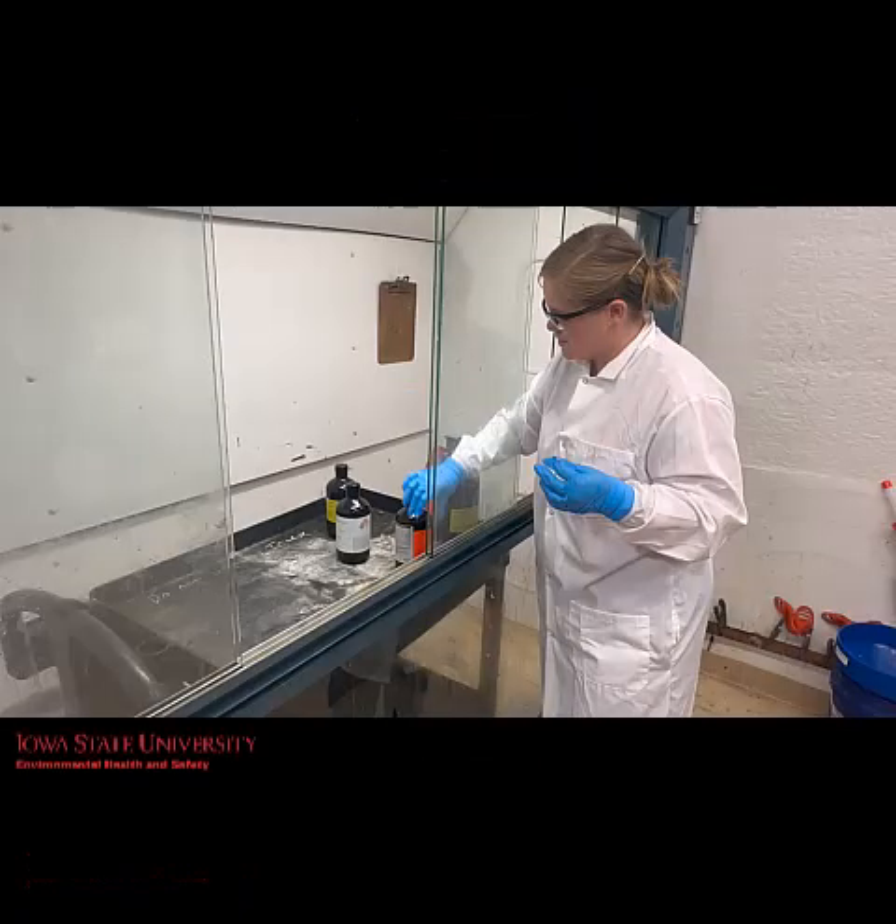This process should be done inside of a fume hood using the appropriate PPE, including safety glasses, lab coat, gloves, long pants, and closed-toed shoes.